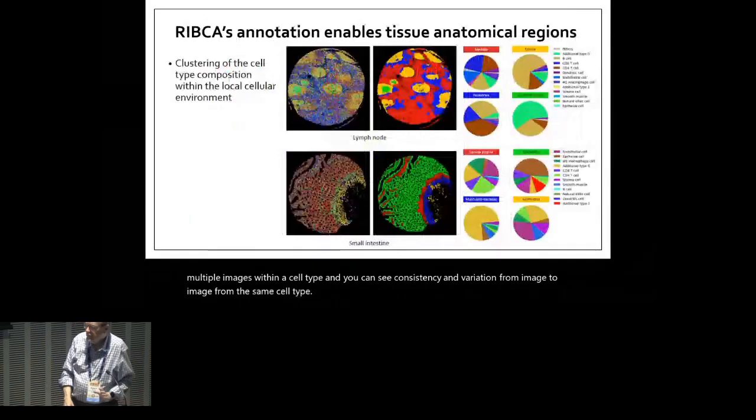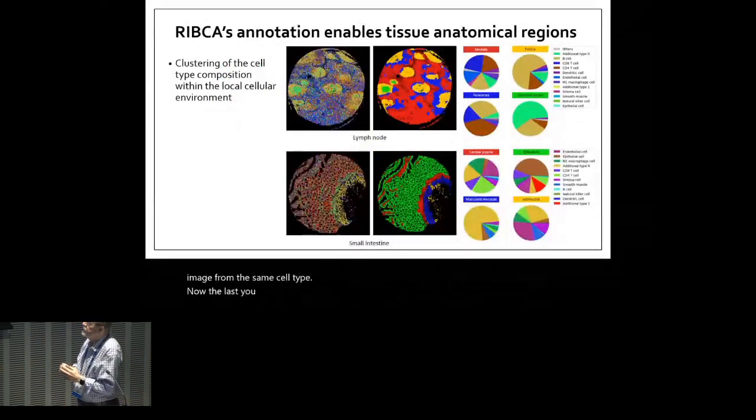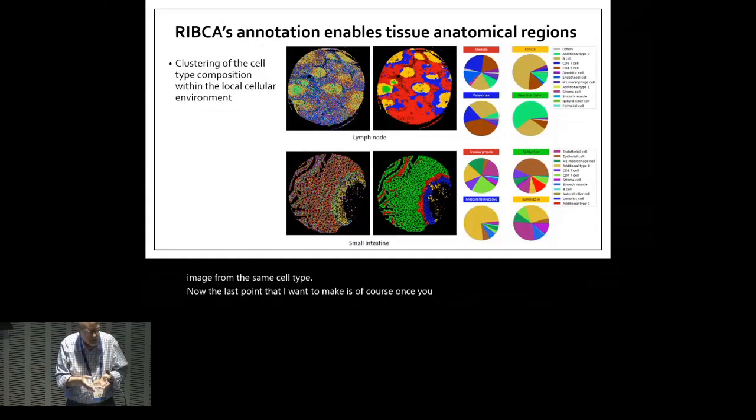Now, the last point that I want to make is that once you have assigned cell types, you can proceed to assign larger elements, larger regions.